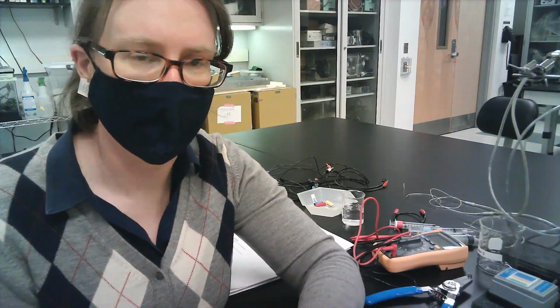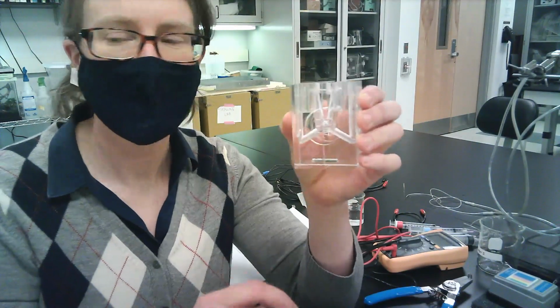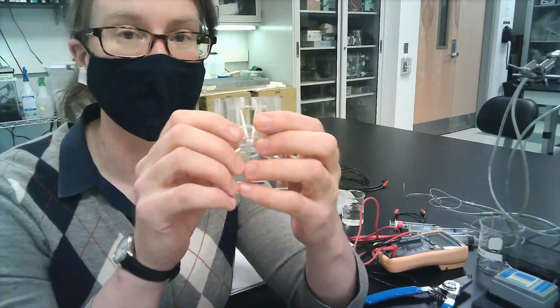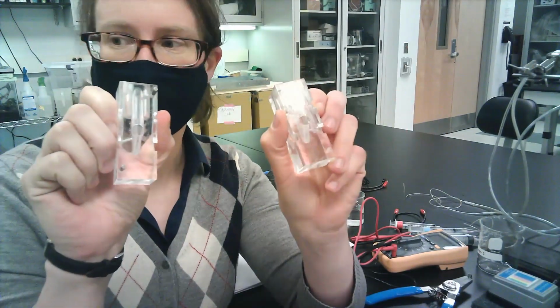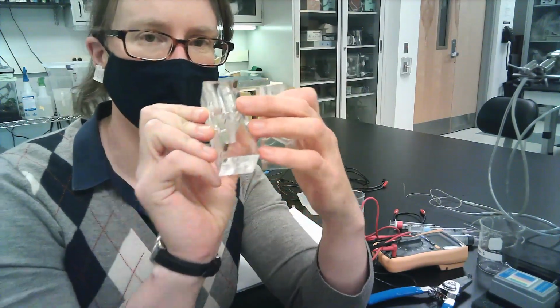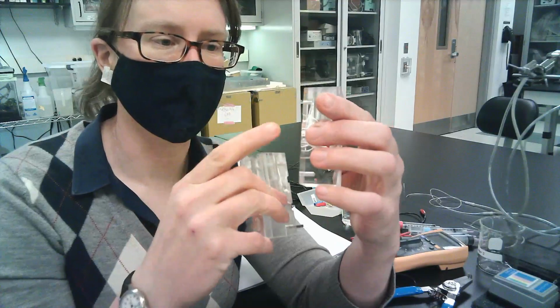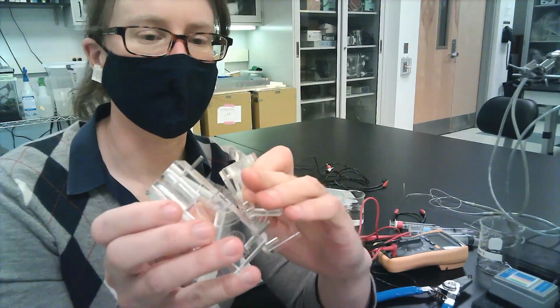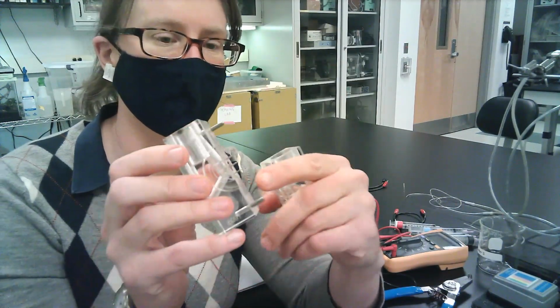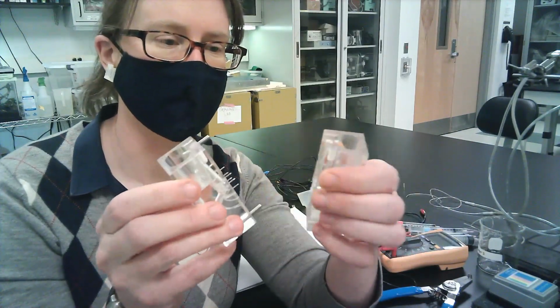At the heart of our labs this week are a set of chambers known as Ussing chambers, named after the inventor. And they're little acrylic chambers. They're small, but they've got a lot of things to them. So first off, they come apart, and you'll notice on the inside there's a little opening here, and there's a set of little prongs on the opposite side. So that little opening is where our tissue is going to wind up being put. So we're going to drape it across these little prongs. We'll also apply just a very fine layer of vacuum grease around the outside just to make sure we have a really good seal.